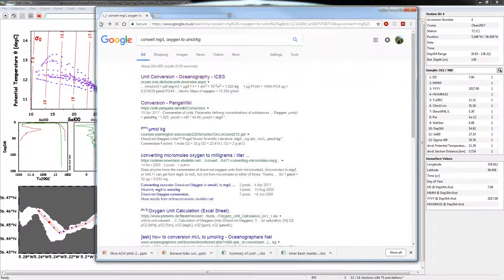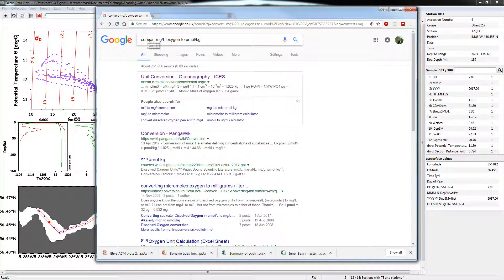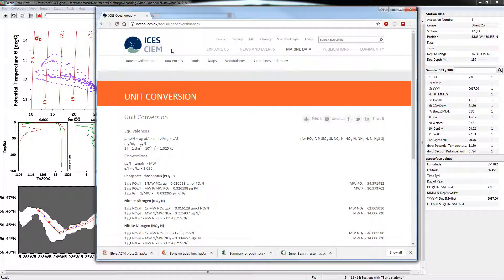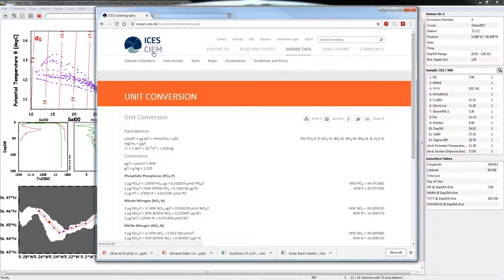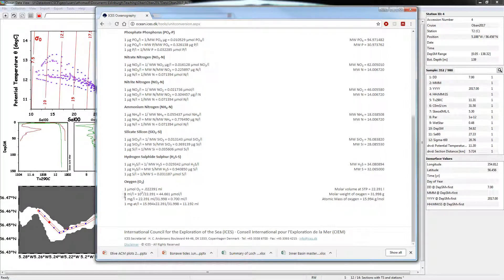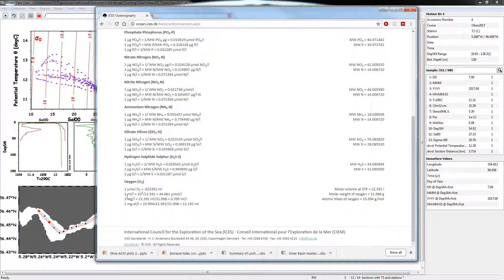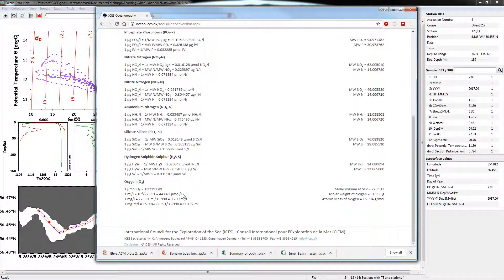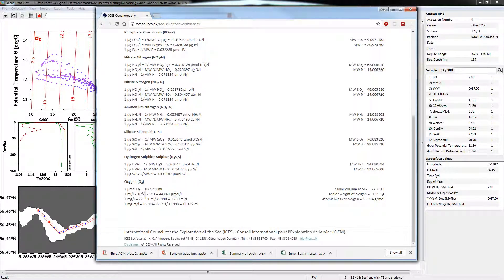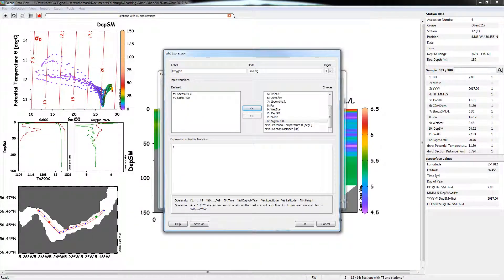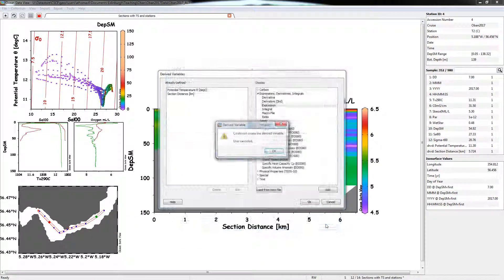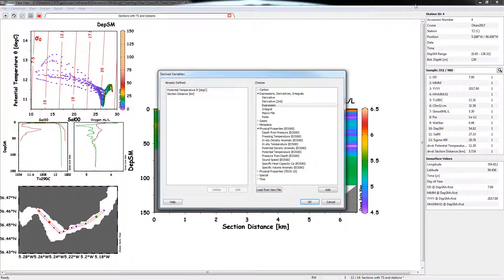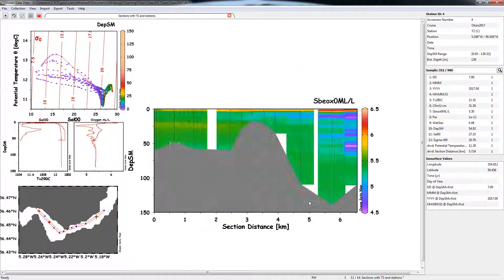So I went to the internet here, and basically I googled convert oxygen to micromoles per kilogram there. And I found this website here, the ICES CIEM, whatever that is, but looks fairly legit. And down at the bottom here we can see if we've got milliliters per liter, to convert that one milliliter per liter of oxygen is 44.661 micromoles per liter. So we just need to times our value by that. But we also need to think about converting it into kilograms. So we need to know the density of the water as well. So if we go back to Ocean Data View.